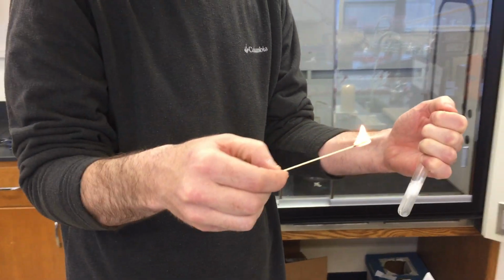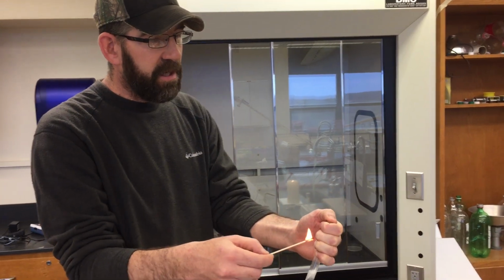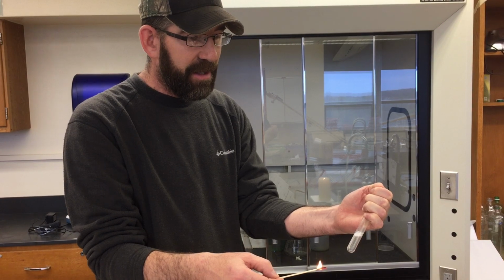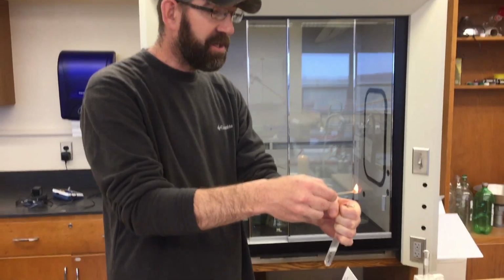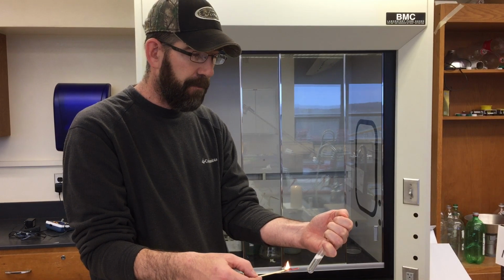And that little pop was the hydrogen gas exploding. The reaction's still going on. We can continue to do it. Here we go again. That explosion can be used to do work. It can be used to make electricity. It could be used in internal combustion engines. And it's a very, very clean fuel. Okay?